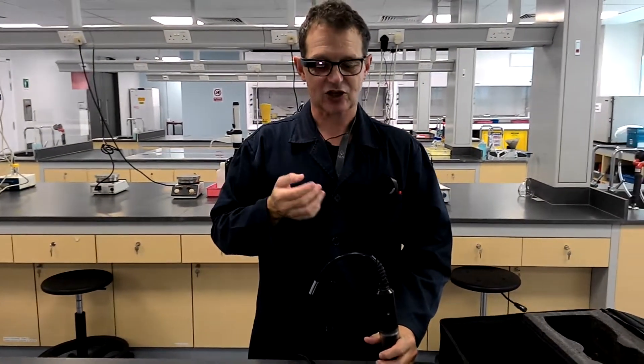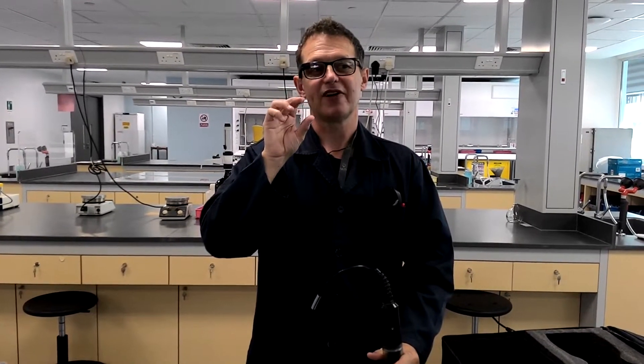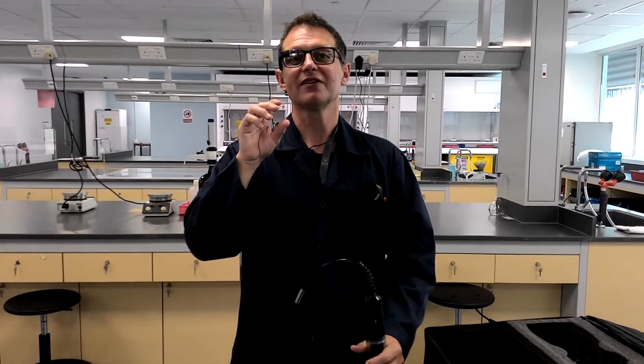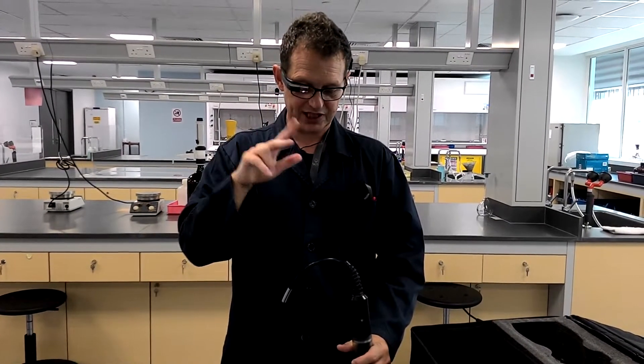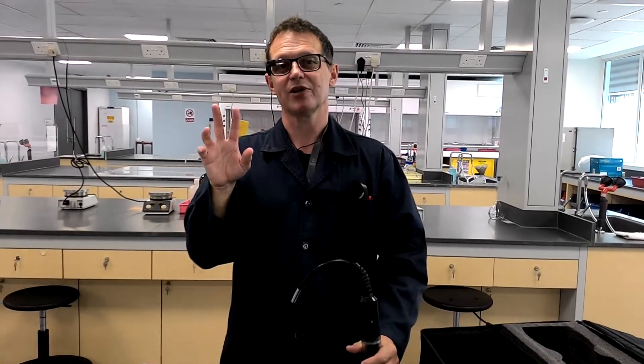The first is that the electrolyte will evaporate out of the electrode. And these electrodes are combination. You have a reference electrode inside the glass electrode. That prevents the reference electrode working. In fact, it destroys it. So that the potential difference that this probe gives from which we get the pH would be fairly meaningless. Secondly, the glass itself, without being complicated, it's not just any old glass that you use for your window that you make a pH probe out of.